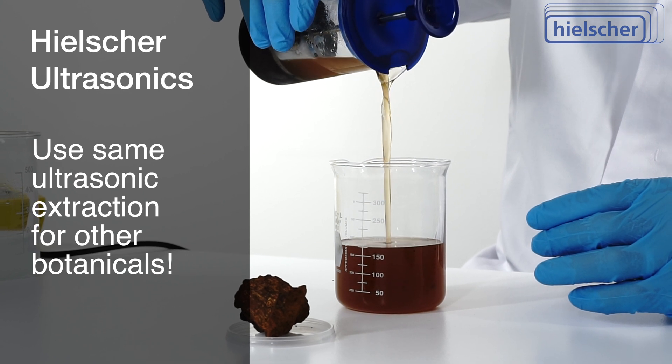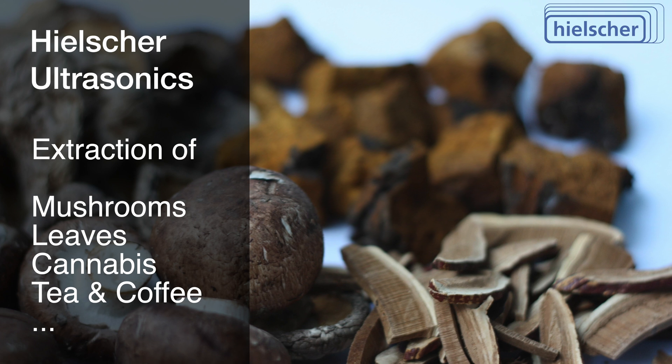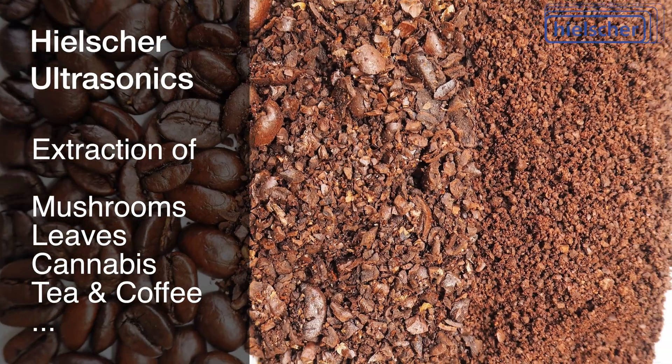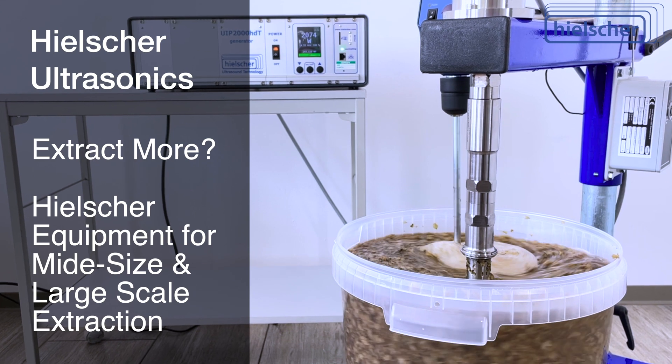This cold water or cold solvent extraction works for all other botanicals. You can extract all kinds of mushrooms, leaves, cannabis, teas, or coffee. Hielscher makes ultrasonic homogenizers for extraction on any scale.